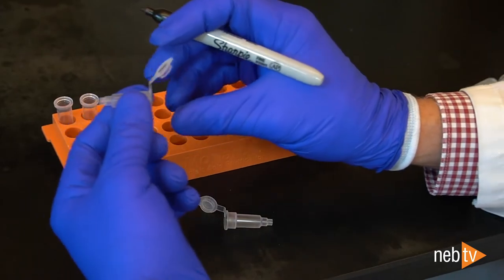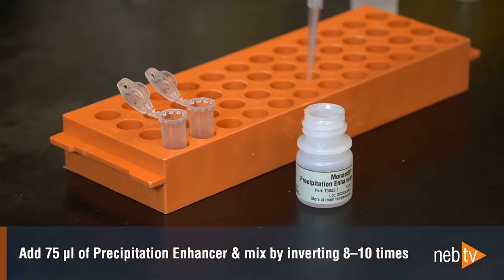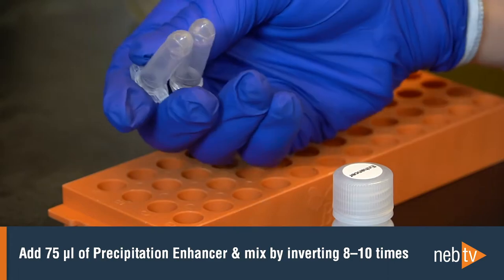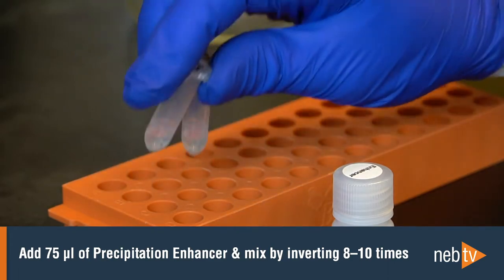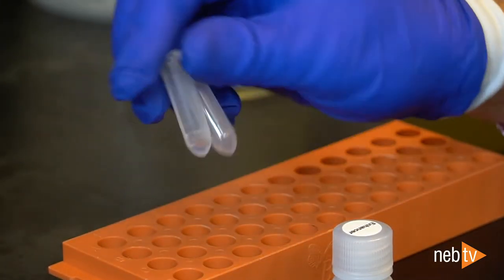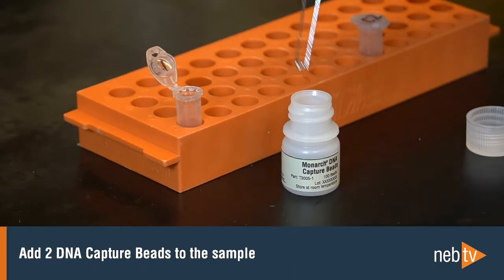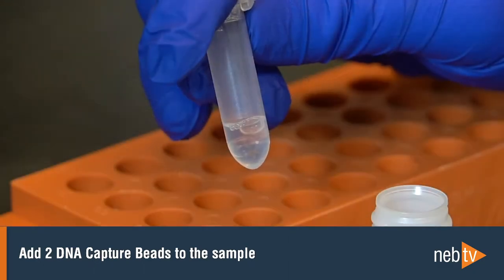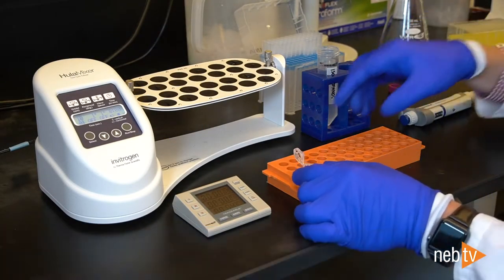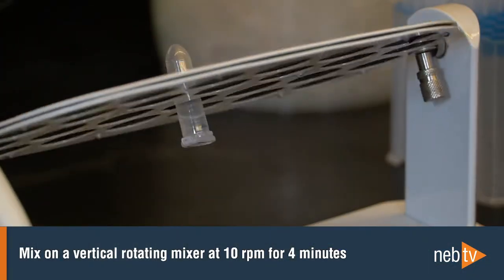During the incubation, it's helpful to prepare and label all the plastics that you will need for part two of the protocol. After the 10 minute incubation, add 75 microliters of precipitation enhancer and mix by inverting 8 to 10 times. This solution creates the optimal salt conditions for the DNA to precipitate and bind to the beads. Using clean forceps, add two DNA capture beads to each sample, which at this point should be contained in a Monarch 2 mL tube. Add 275 microliters of isopropanol, close the cap, and mix on a vertical rotating mixer at 10 RPM for 4 minutes to attach the DNA to the beads.